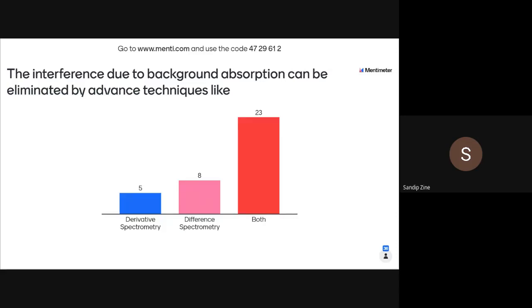Now Saurabh has written, Yadav Saurabh, that is absorbance versus wavelength. Yes, Nazia has also reflected the same answer, absorbance versus wavelength. So absorbance versus wavelength is the correct answer, and we will get output to find out lambda max of a given compound on this graph, absorbance versus wavelength.